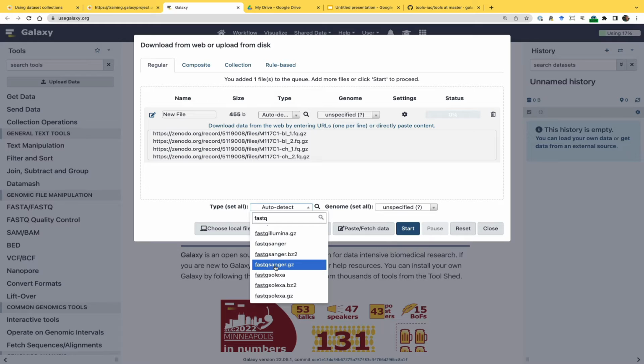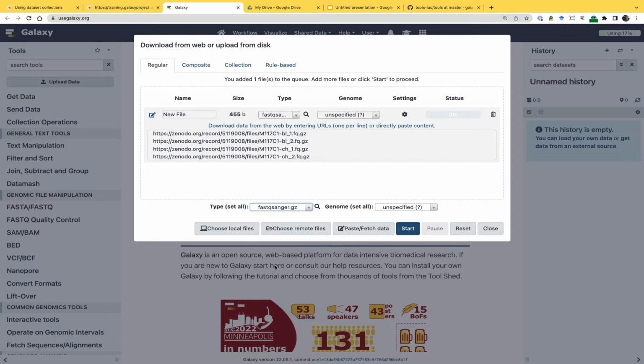And this metric, there are several ways to express that. So one of these ways is the so-called Sanger metric. And this is the standard way we encode things right now. But if you were doing things prior to 5 years ago, if you have really old data, that's where it gets a little complicated, because there was base 64 encoding, there was encoding where they were just putting actual numbers in the file, so there was a lot of mess in the beginning when sequencing technologies were evolving. Anyway, I'm talking too much, so select this and just click Start.